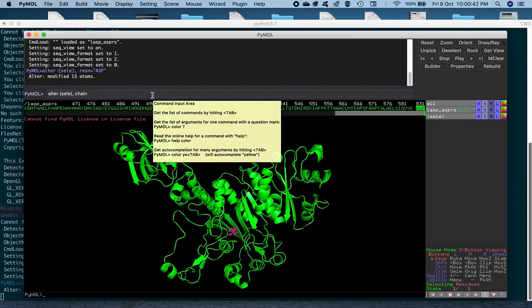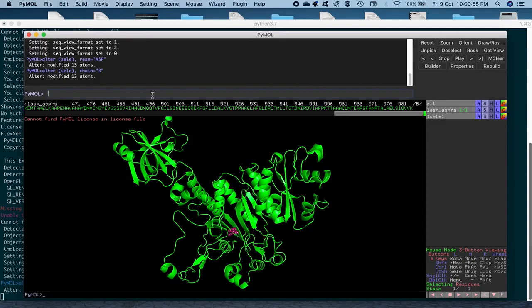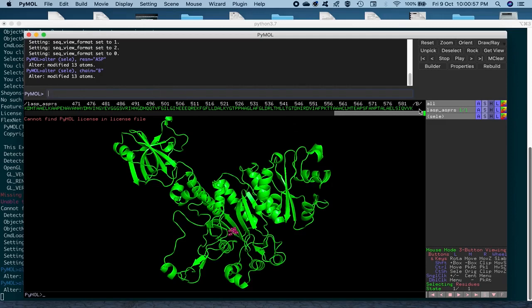Chain is equal to, within quotes, B, chain is equal to B, and then press Enter. And you see immediately the change happening here. So, the chain is changed to B.